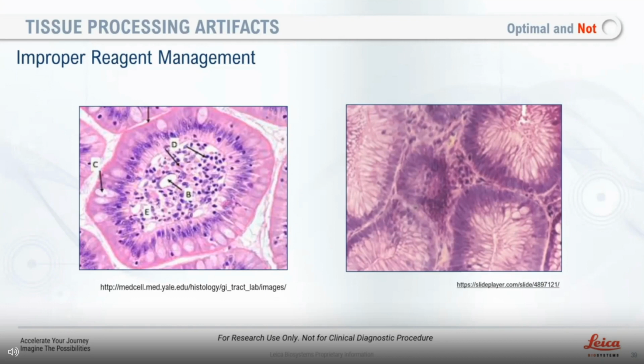I think the critical component is ensuring that when you are ready to embed your tissue, it comes back up to the temp of your embedding center. The cassette can't just be warm, you want to make sure your tissue is warm all the way through, right? Because if you embed it and the tissue is slightly cooler, then you may not get the melding of the paraffin to the tissue, and then you can have trouble sectioning.